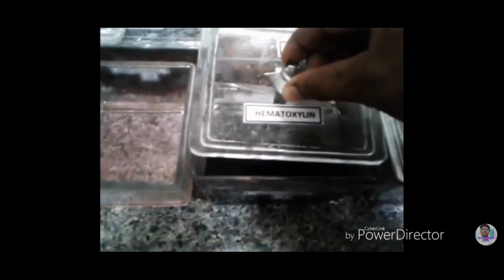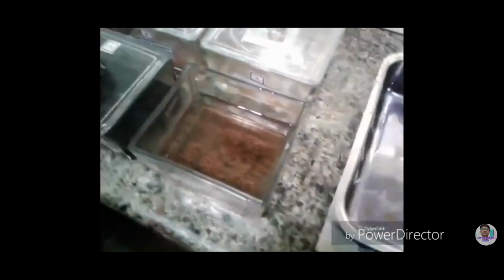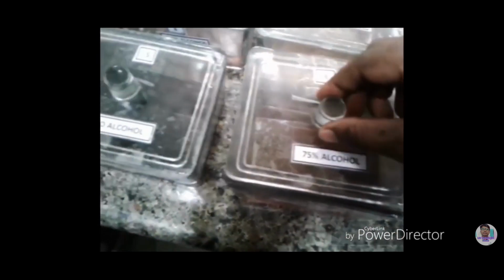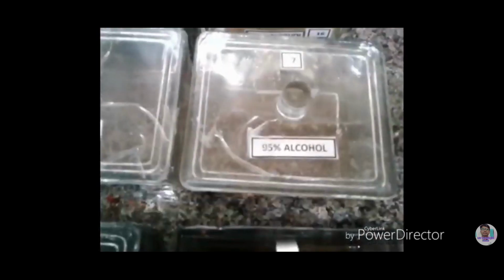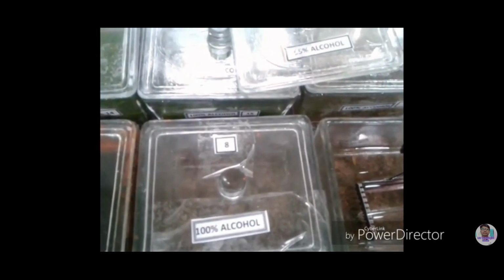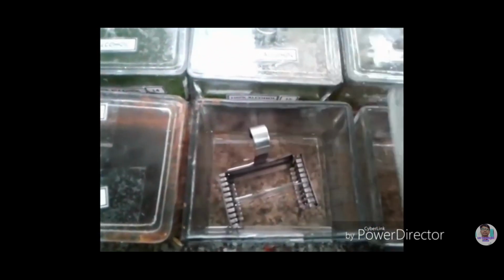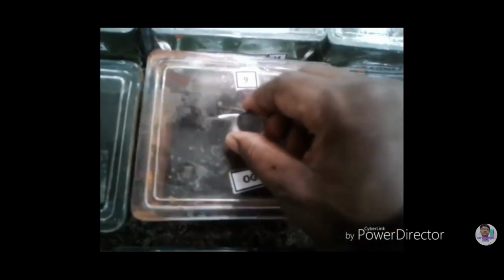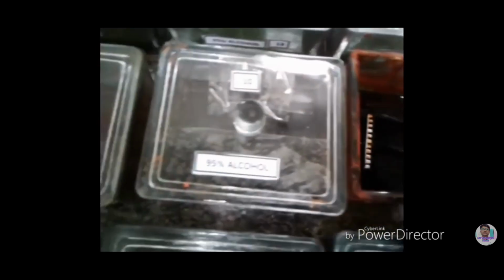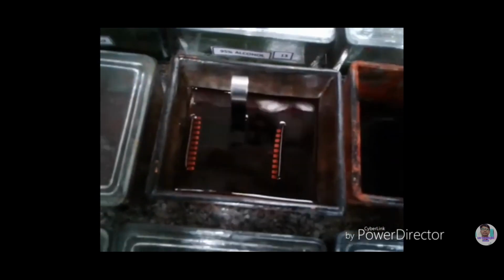Rinse again gently in tap water to prevent cells from being washed off, for 2 minutes. Differentiate carefully the nuclear staining in acid alcohol for approximately 10 seconds or at least until the sections become faint pink. Bluing agent used can be ammonia water, Scott's tap water substitute, or lithium carbonate. And rinse it again in distilled water for another 2 minutes. Dehydrate it with 70% alcohol for another 2 minutes. Dehydrate once again in 95% alcohol for 2 minutes and another 95% alcohol for 2 minutes.